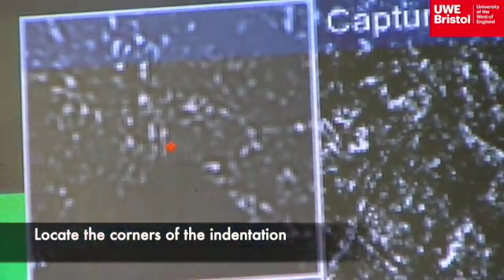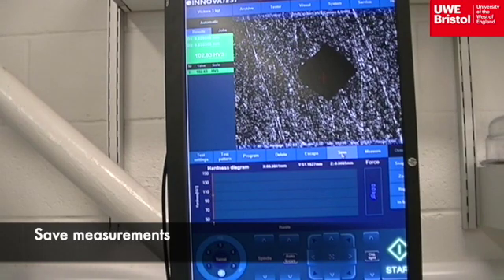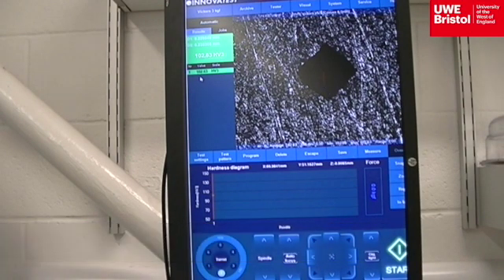When done for each corner, the save icon is selected and the hardness Vickers measurement is displayed on the left hand side results column. For aluminium cold drawn, the result is 102.6 HV3.